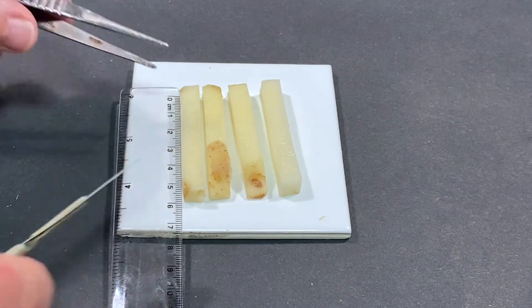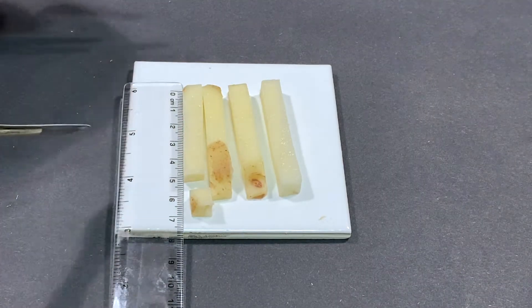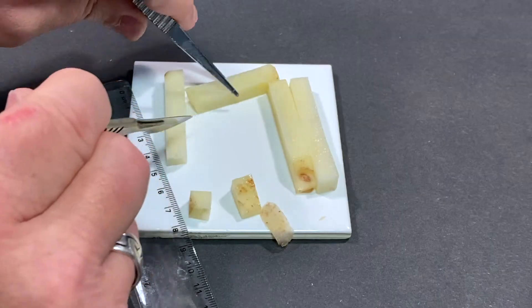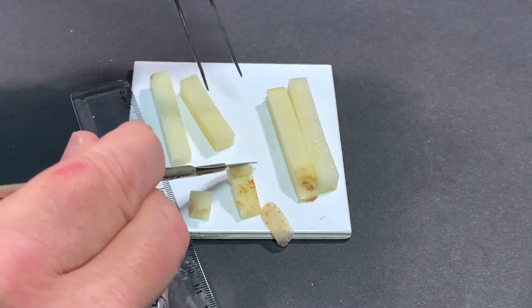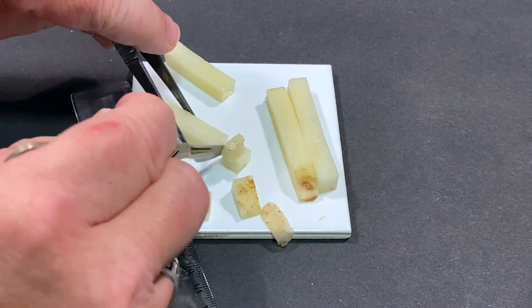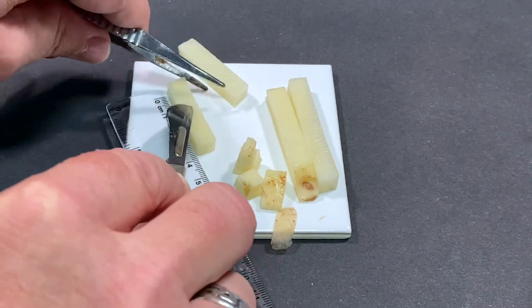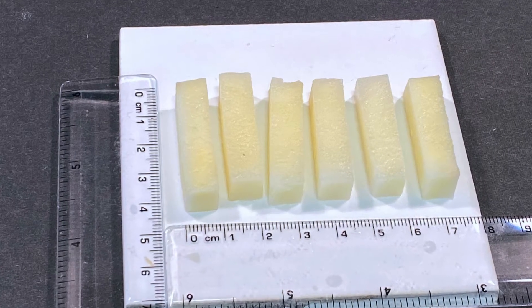Trim away any remaining skin from the potato sections to create even samples. Please adhere to the health and safety guidelines when using bladed or sharp equipment. Trim all the potato sections to an even length so they are uniform. At the end of this process you will require six even potato samples.